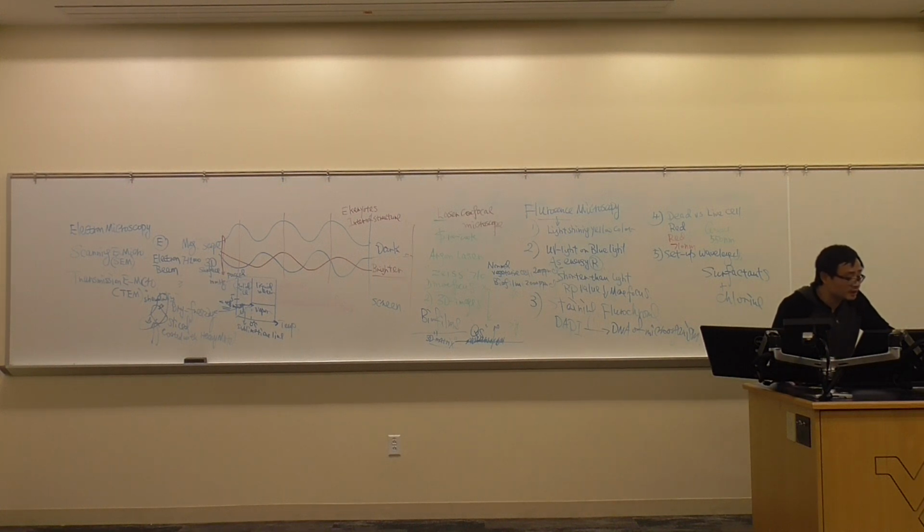And you cannot even measure the width. And the height is dramatically increased compared to the non-treatment. So you can clearly see this is a more organized morphology compared to using 0.5% concentration of the antimicrobials, where they get killed and damaged.